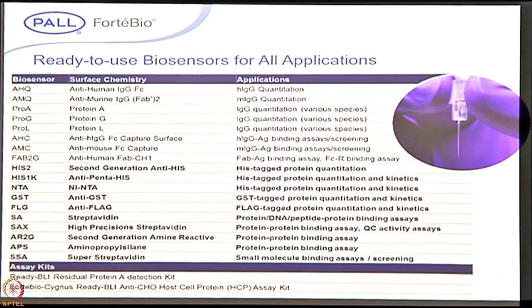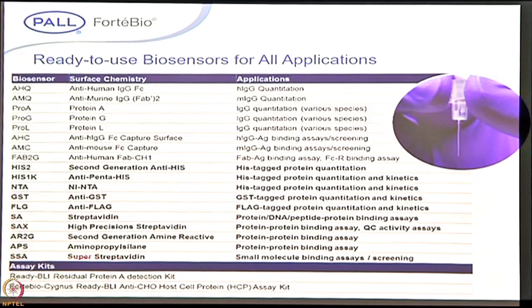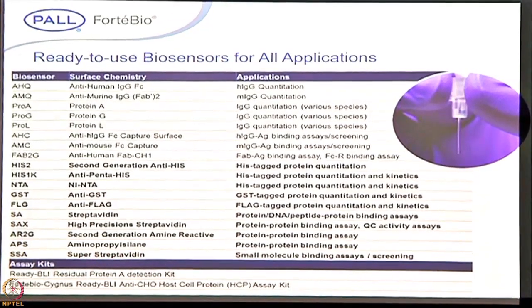And if there is no tag in your expression, then you can biotinylate your protein of interest and couple the biotinylated protein to the streptavidin sensor. We have APS sensors, aminopropylsilane, for hydrophobic interaction. If your protein is more hydrophobic, you need no tag or anything, you can just bind the protein of interest on that. And for the super streptavidin, this is a quartz based sensor, especially for small molecule protein interactions.